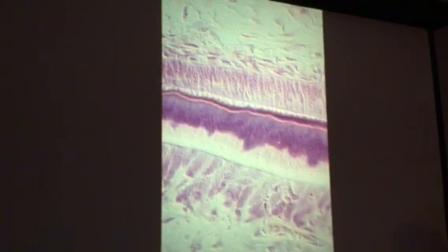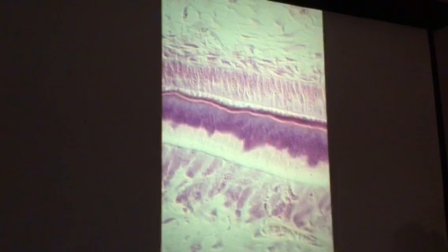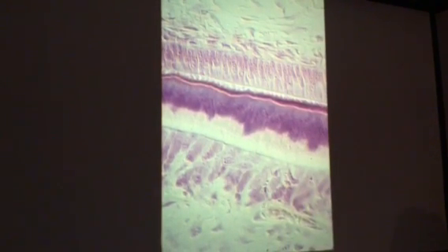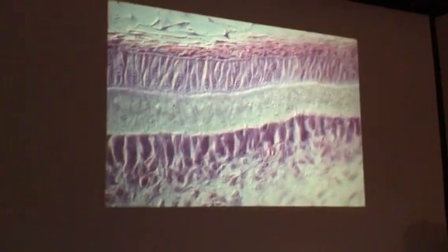Okay, and more examples of calcospheric deposition or calcification of some odontoblasts, and perhaps even some capillaries coming in between those, and more of those Tomes processes right there. And this is pretty much the same. Let's see what else we have here.